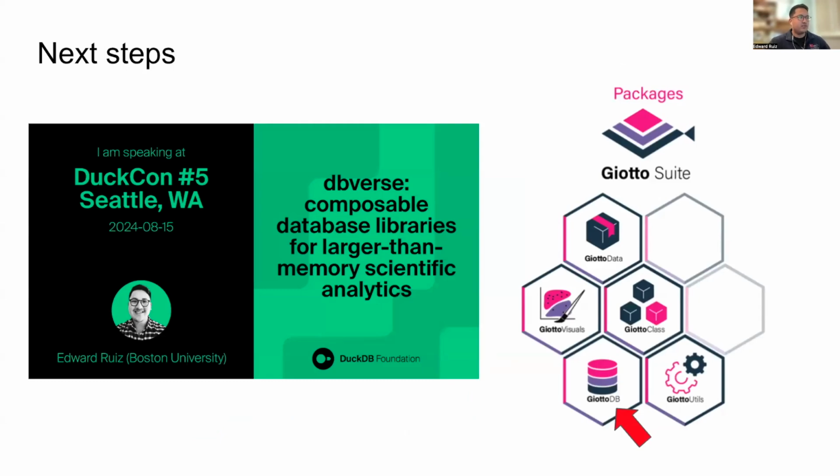So this is just a preview of what we've been working on. We're very excited to be at the DuckDB conference next week, where I'll be talking more about these packages. We are also actively working on wrapping these packages in Giotto DB so that we can address a lot of our scalability issues.